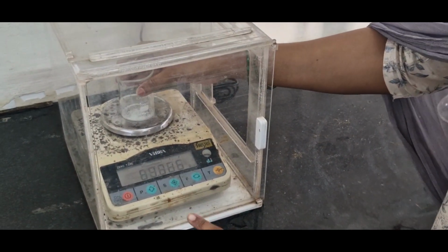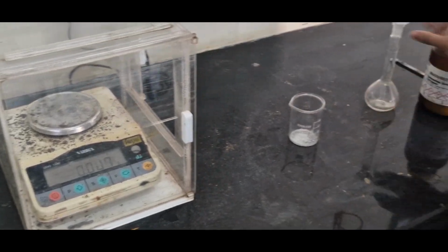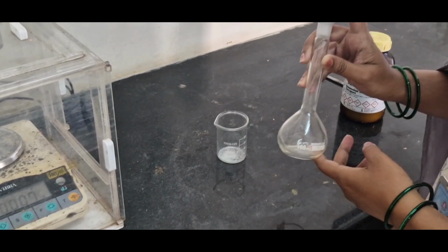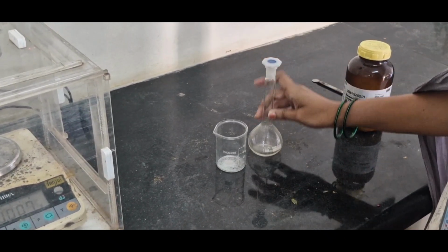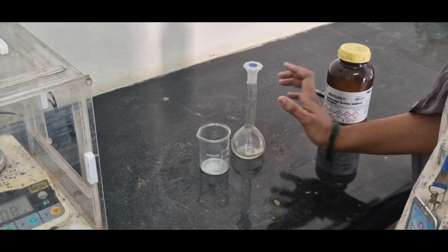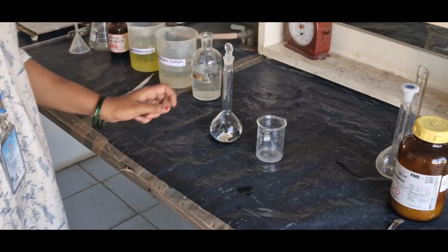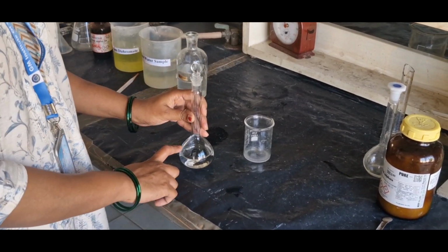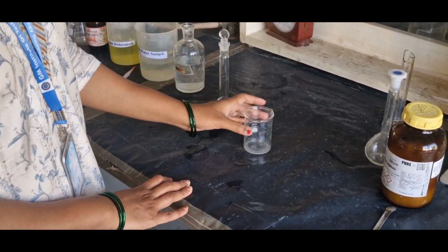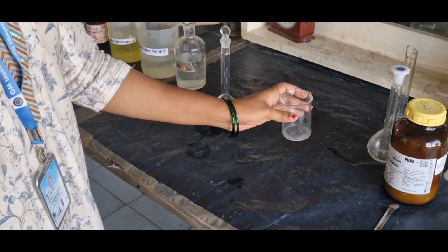And note down this as W1. Now transfer the weighed FAS into a 100 ml volumetric flask, add half a test tube of H2SO4 and make up the volume up to the mark. So now I have prepared the FAS solution by dissolving the FAS that I weighed. Then after transferring, take the weight of this empty beaker and note it down as W2.